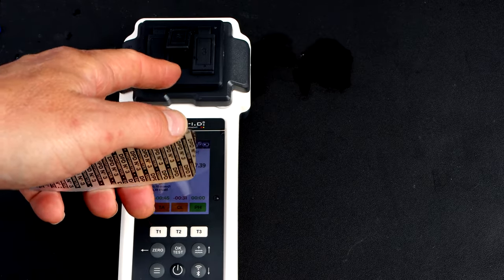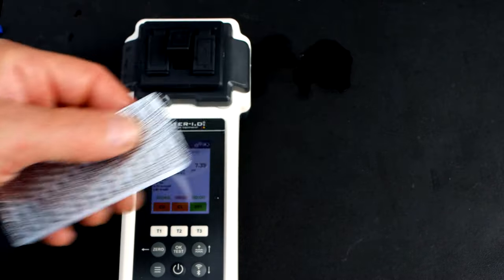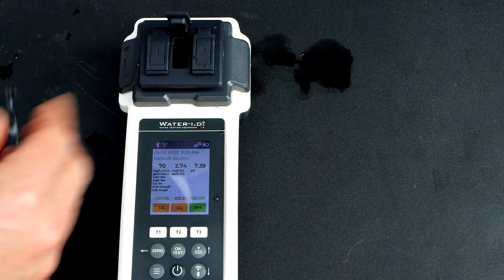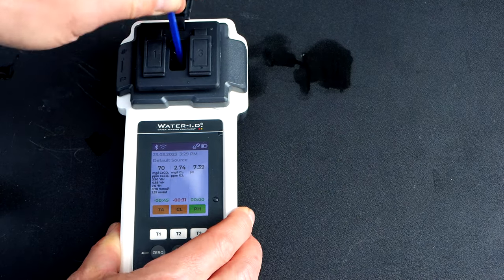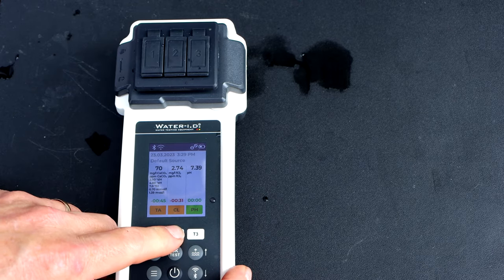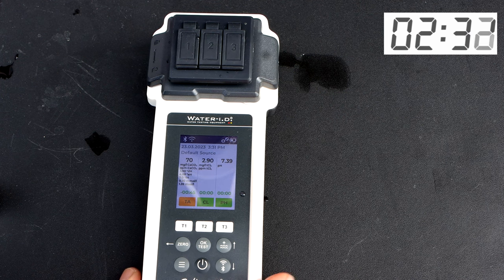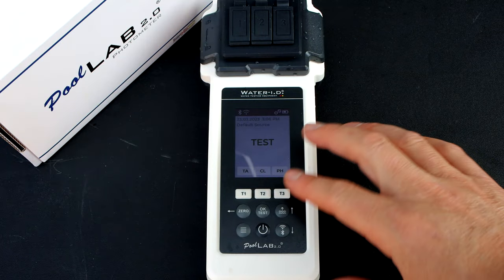You can see that the total chlorine is coming in at 2.9. You can also do a single parameter. You go ahead and hold down test 2, now you can scroll between the different tests. I'm going to do cyanuric acid.